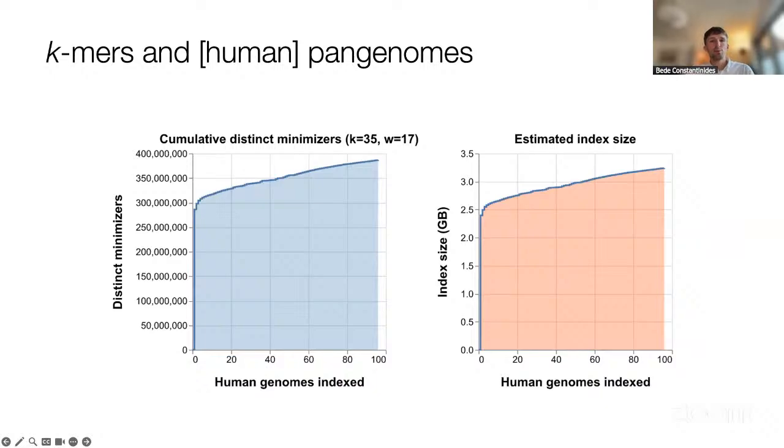So if we naively try to use a read aligner like Minimap2 to index 100 human genomes, our index would become 100 times larger and unwieldy with mostly redundant sequences. And we'd need a huge amount of computer memory and alignment would be slow. We could use a pangenome graph aligner and a pangenome graph reference, but in my testing, this is just quite a bit slower. So k-mers and minimizers, on the other hand, naturally represent pangenomes very efficiently.